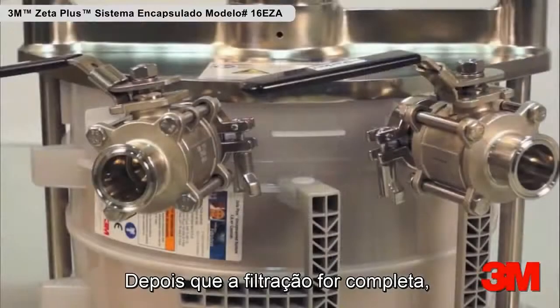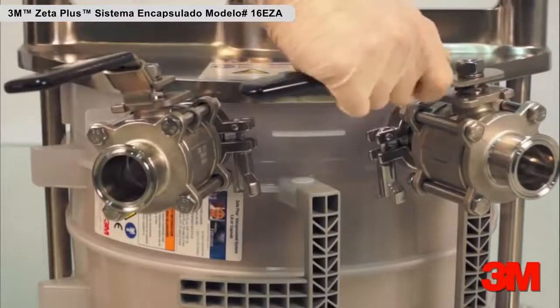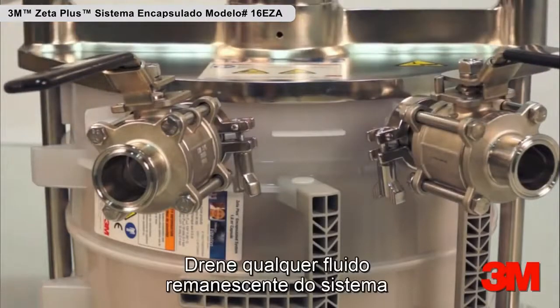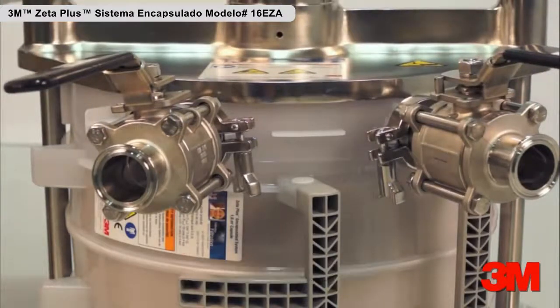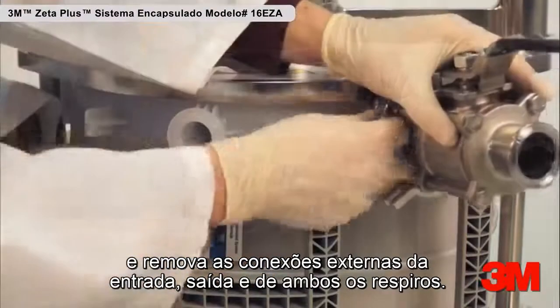After filtration is completed, open the vent valves to relieve the internal pressure. Drain any remaining fluid from the system and remove the external connections from the inlet, outlet, and both vents.